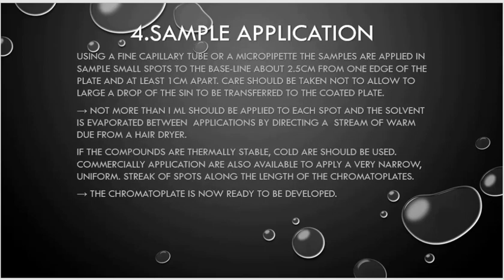Now the fourth step is sample application, and how to apply our sample on the TLC plate. Using a fine capillary tube or a micropipette, the sample is applied as a small spot on the baseline about 2.5 cm from the edge of the plate, at least 1 cm apart. Care should be taken not to allow a large drop to be transferred to the coated plate.